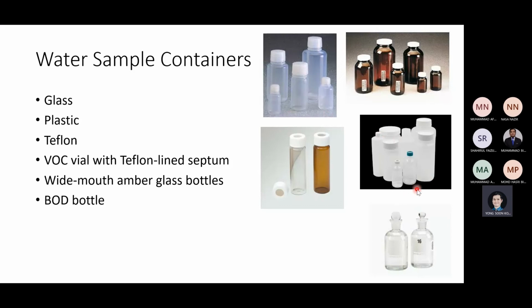This one is preferred. The other two, amber glass bottle, because when we talk about glass, usually it's about organic analyte, so that's why it's usually amber. But at times, this reagent bottle may be used. I mean, of course.